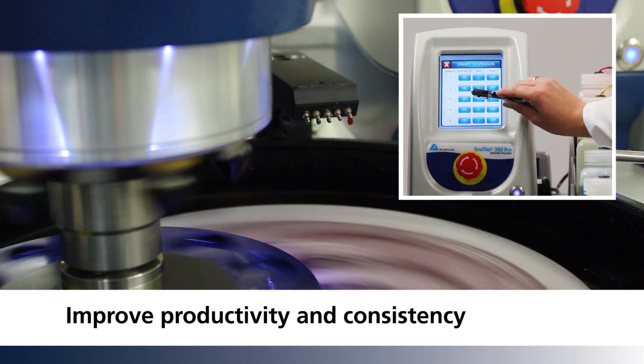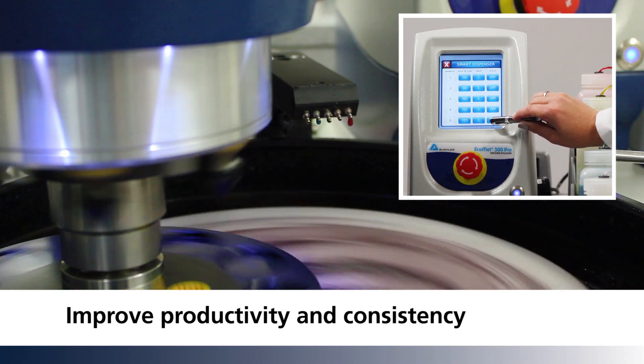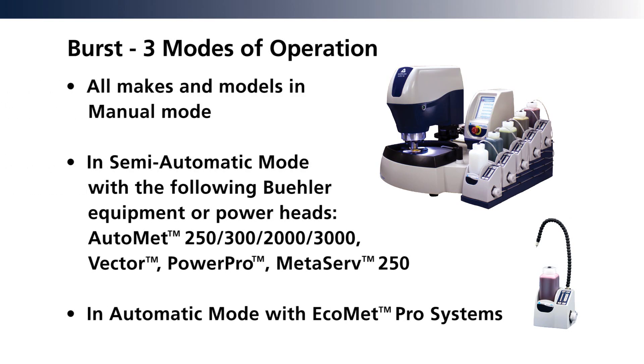The Pro model seamlessly integrates the BURST dispensing system, whether using one BURST unit or five. The BURST dispensing system increases consistency, saves time, and reduces waste. Fully integrated with EcoMet Pro systems, the BURST can be used in semi-automatic mode or manual mode.